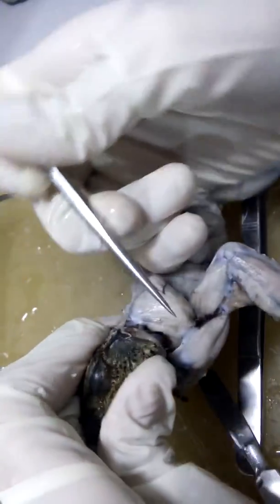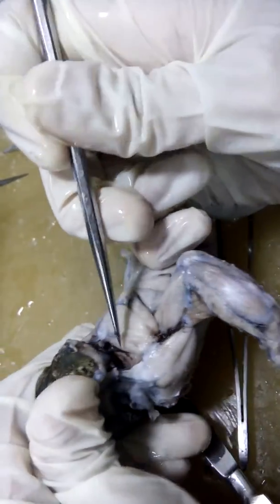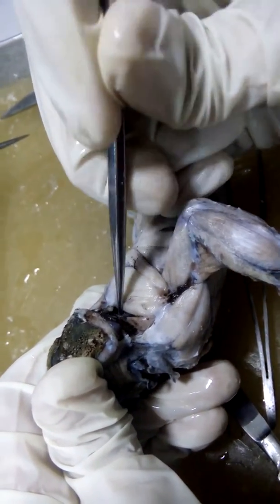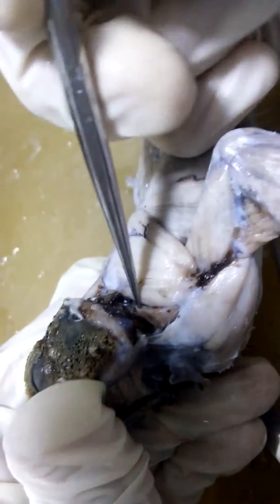levator scapulae superior. So it's somewhere here, there. So just internal to your levator scapulae inferior.